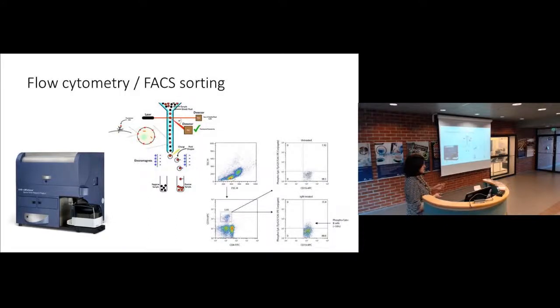You can analyze millions of cells with this, and you can combine. We have this Becton Dickinson Fortessa in our department. You can simultaneously measure about 14 different antibodies with that. We have a 4-laser system there, and that's a pretty standard way to do single-cell protein analysis.